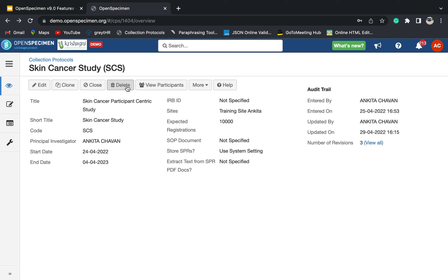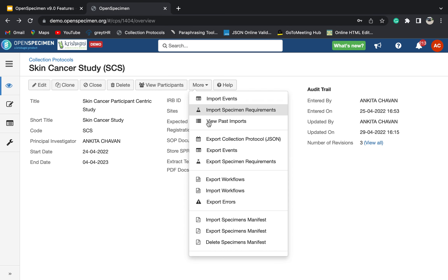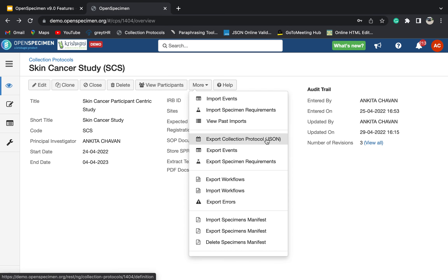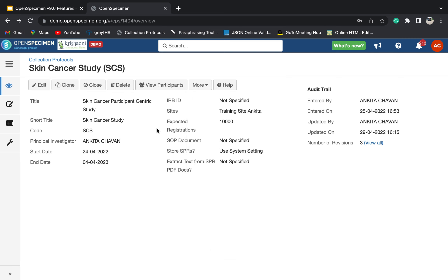Next is delete. If you no longer want the CP and you don't want to use it, you can click on delete. Delete will basically delete all the participant and its associated things from the system. Next is export collection protocol JSON. For example, if you want to move your CP to production or if you want to share it with some other users of OpenSpecimen, you can export your collection protocol JSON and do it that way.